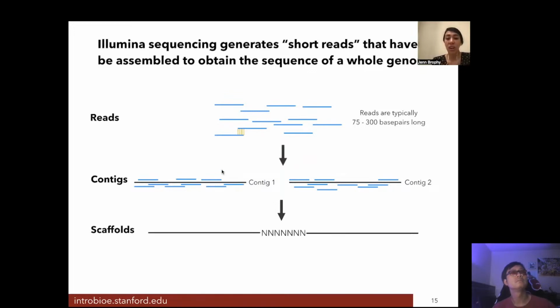And when you want to figure out how the whole genome is assembled together, then you would assemble each of these little short reads into contigs. So what does that mean? That means you would look for regions where they overlap slightly, or significantly even, and say, okay, clearly these two segments of DNA are next to each other, partially overlapping.